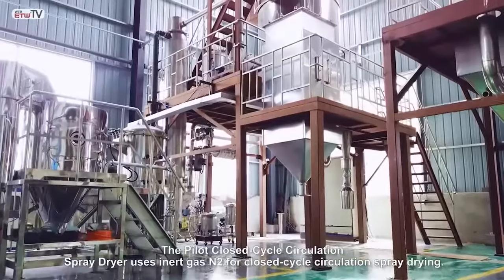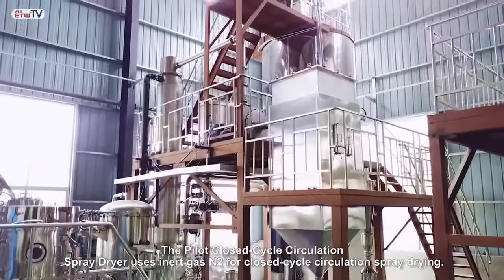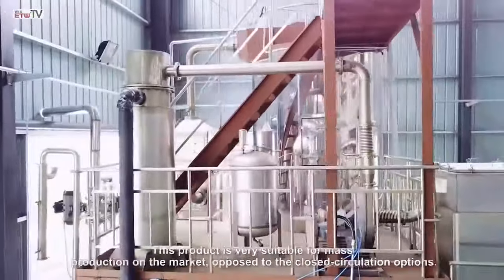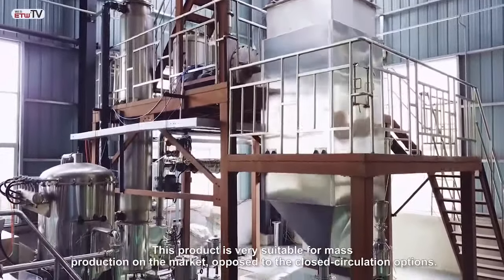The pilot closed cycle circulation spray dryer uses inert gas N2 for closed cycle circulation spray drying. The drying process requires the isolation of oxygen in order to obtain a powdered product. This product is very suitable for mass production on the market, as opposed to open circulation options.